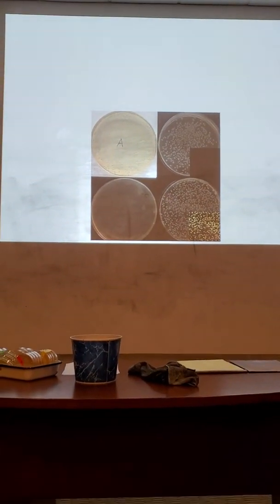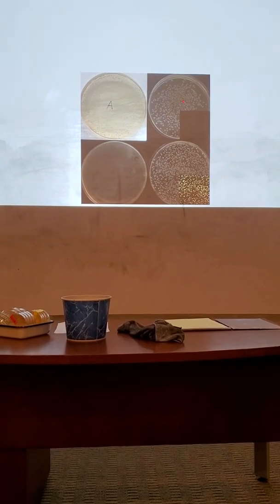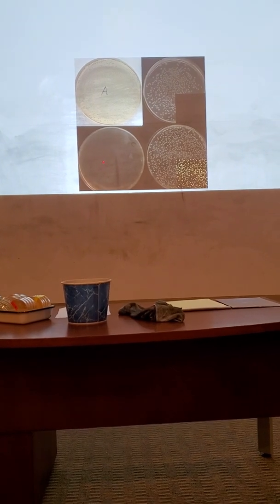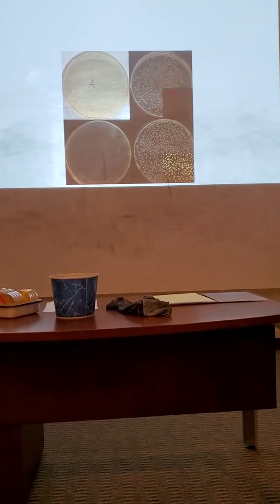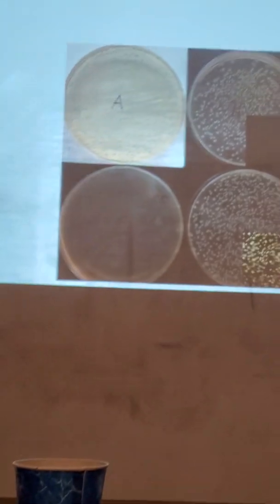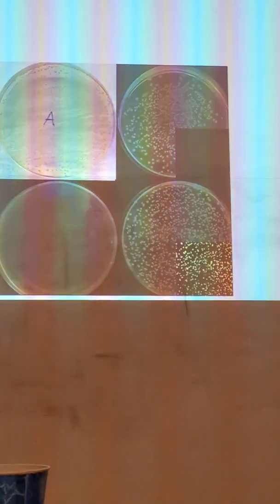The alternative one was this one. Again, same idea. I photographed this plate on white paper so you could see the blue pigmentation. Then going clockwise from there, this was cells transformed with sample B. This is cells transformed with sample C. This is cells transformed with sample D. Then I turned out the lights and photographed it again. So this little inset here shows no glow on these, and the little inset here shows these were glowing in the dark, and I was able to get a little picture of that.